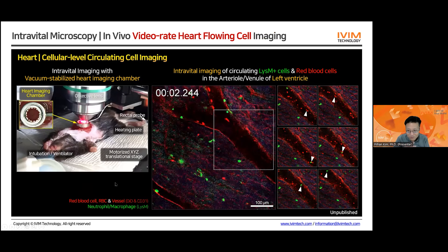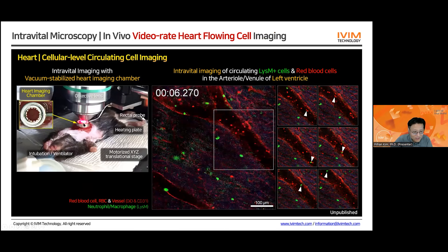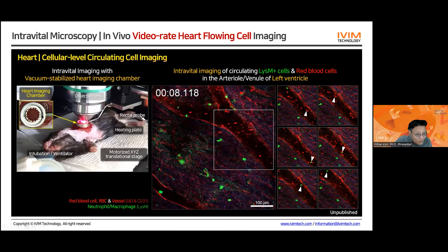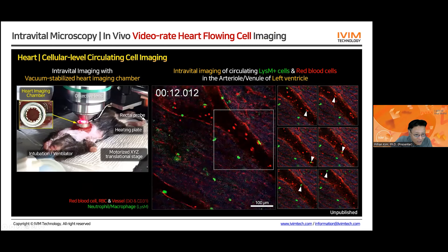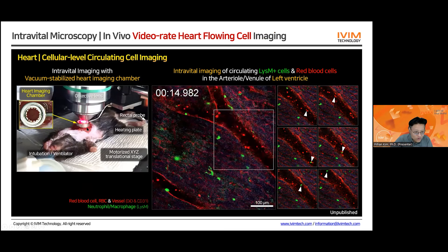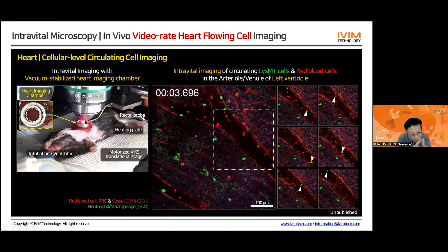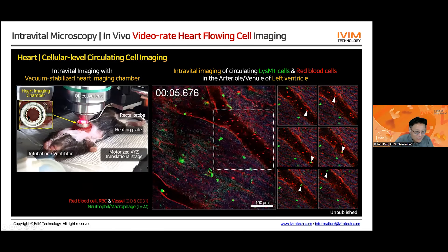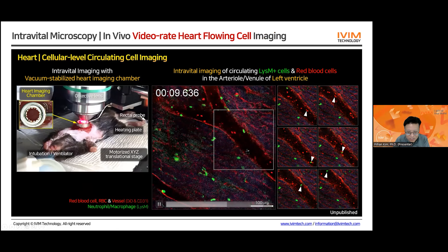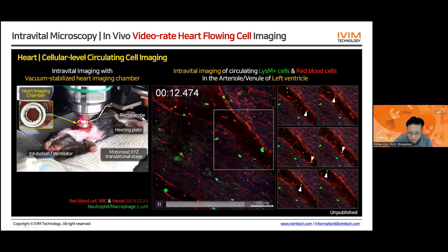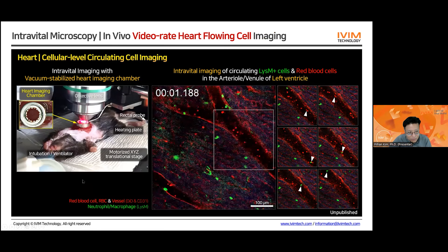We can obtain this kind of flowing cell imaging in other tissues like the heart. We use the same suction principle to build up negative air pressure and stabilize the beating heart — the small part of the heart is stabilized against the transparent cover glass. Our system is capable of 30 frames per second video-rate imaging, so we can directly see the flowing cells inside the vessel of this heart.